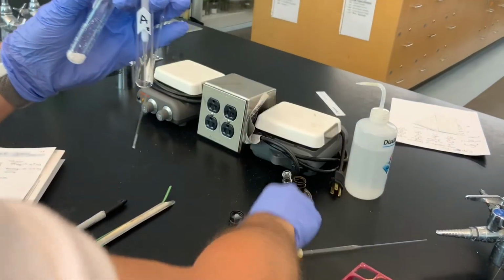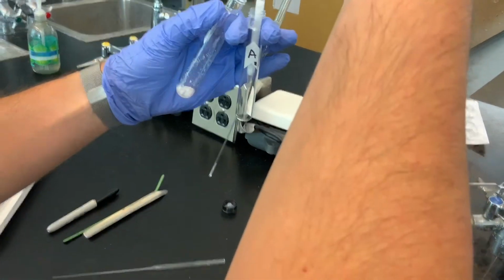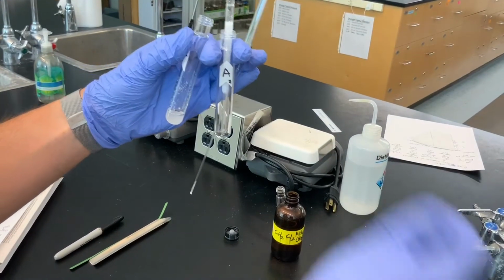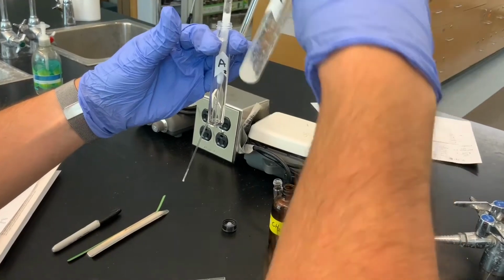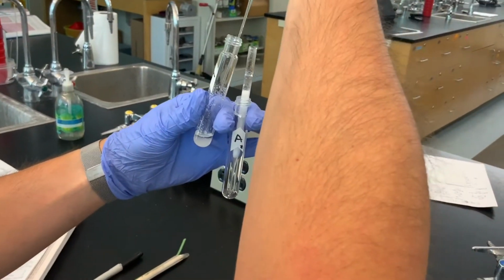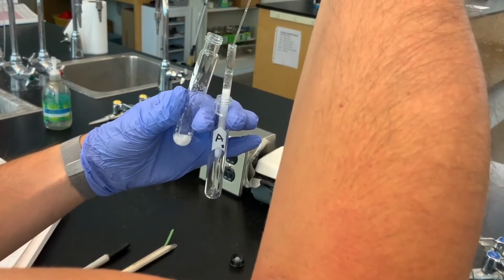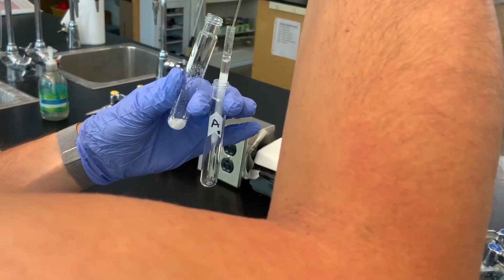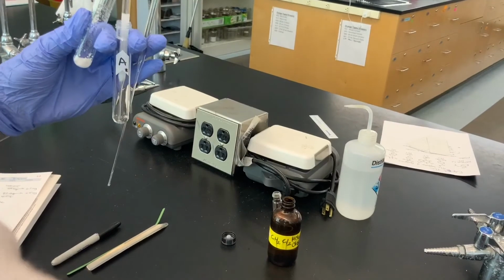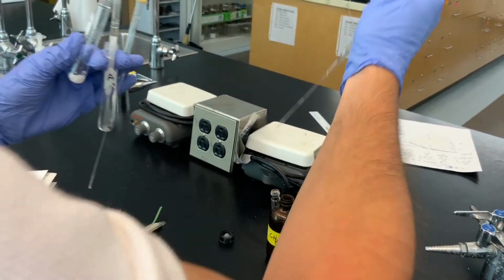And now I want to use clean methylene chloride to rinse my culture tube. So once again, we're trying to get a quantitative transfer. And it's also rinsing the column of any benzoic acid. And might as well do this 3 times, because that's a magic number.